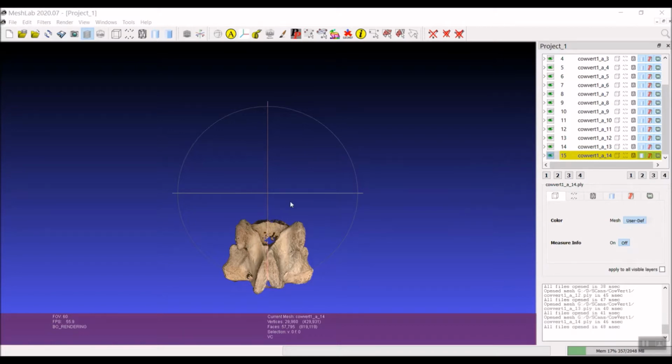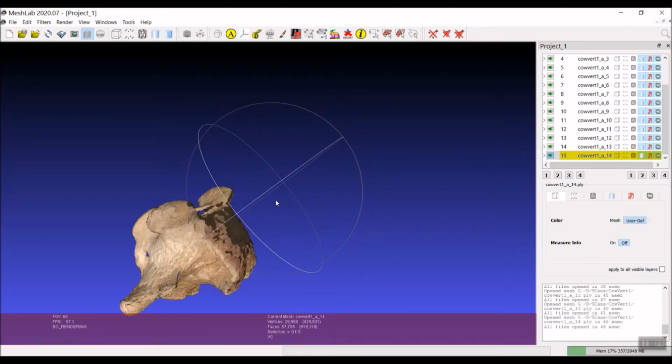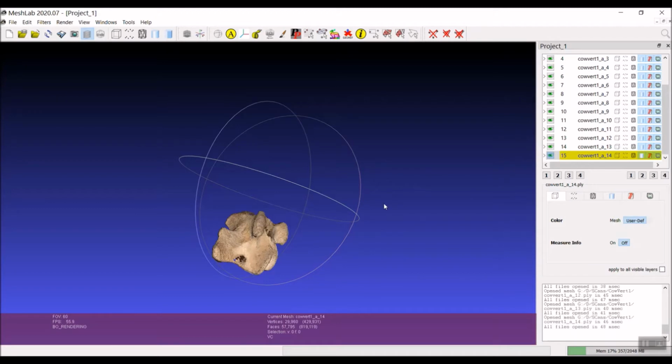So for this example, this is a little vertebra. I think this was from a package of oxtail soup, but it has some nice features that will be good to demonstrate. I have two scan families for this, and I went ahead and edited out the scan fixture. This was from Scan Studio, and Scan Studio especially is really slow when you try to process. And I don't even like the color usually that it spits out when you hit fuse.